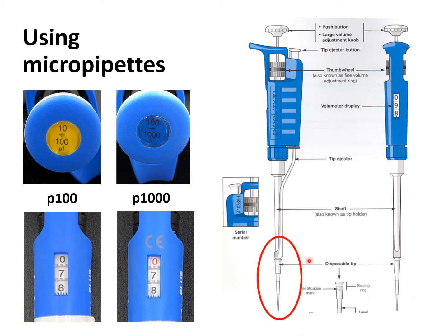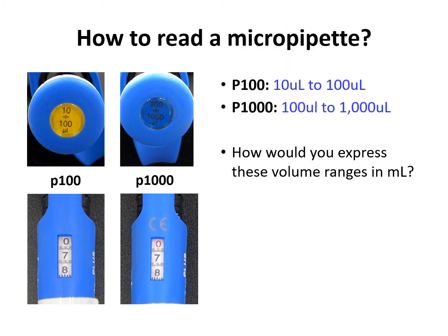And we already talked about the tip and how important it is. Again, just to reiterate, make sure that you always change your tip before moving on to a different sample. Okay, now let's talk about how to read that micropipette.